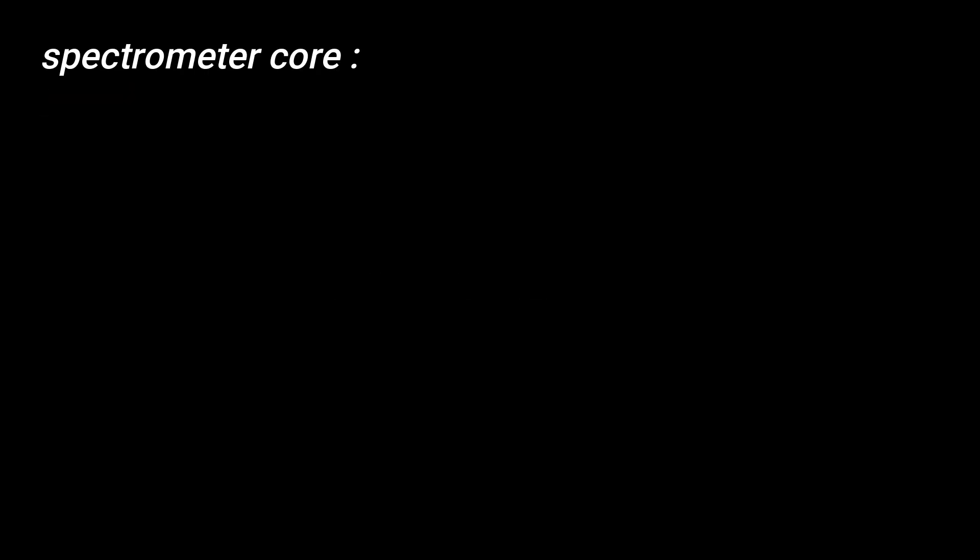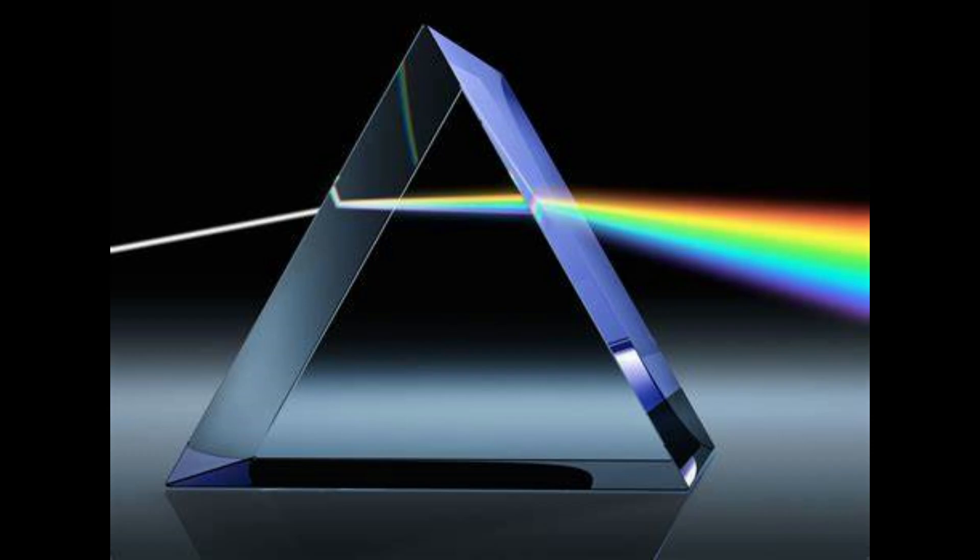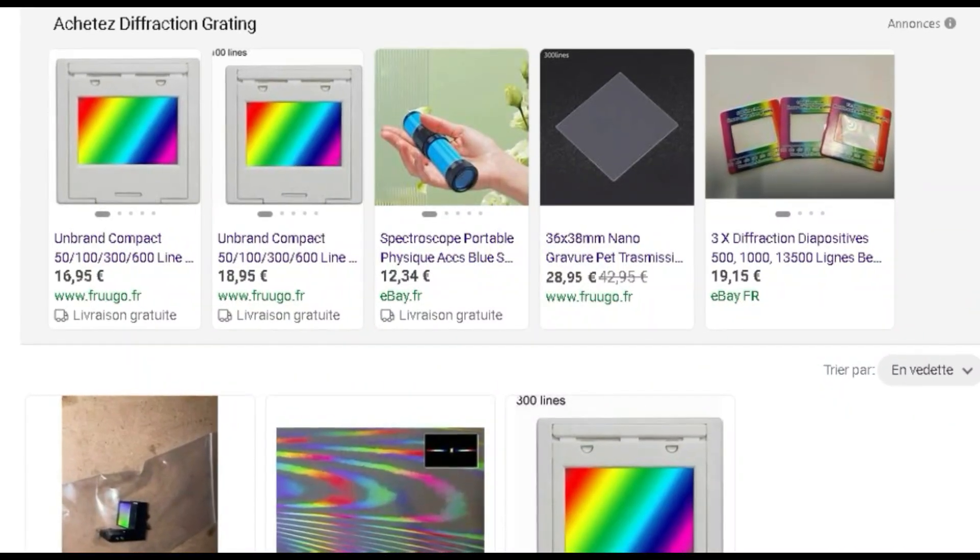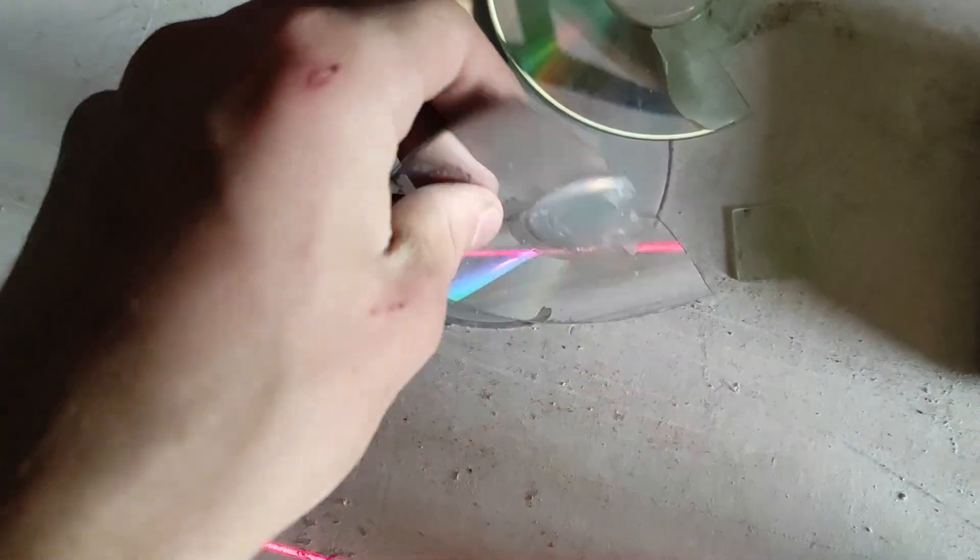The most important part is the diffraction grating. Basically, it's the same as a prism, but it's flat. It's the piece that allows the light to be separated into the rainbow. And you can buy one on internet, or you can also use a piece of DVD or CD like me.